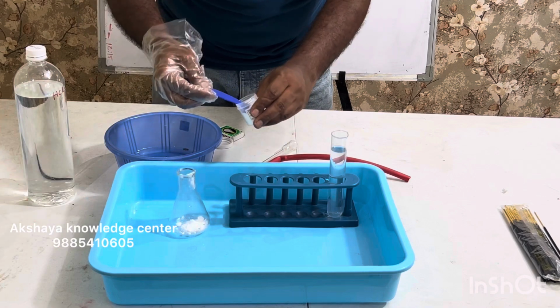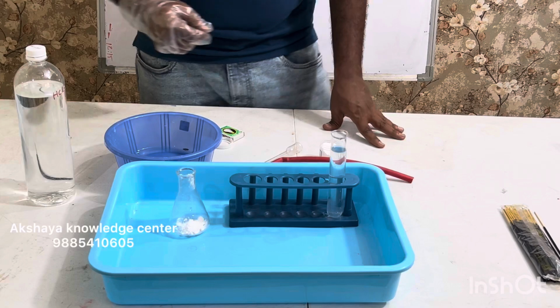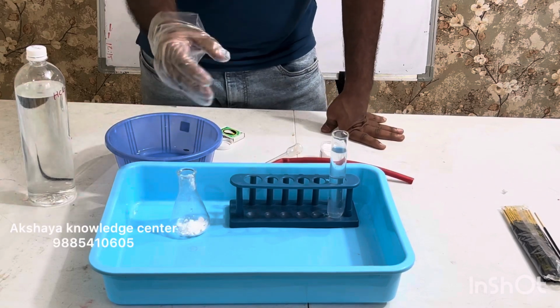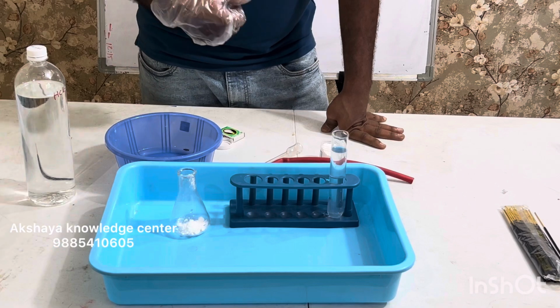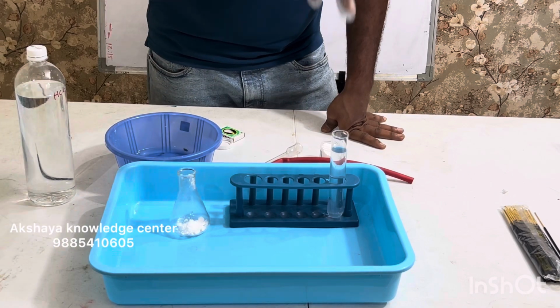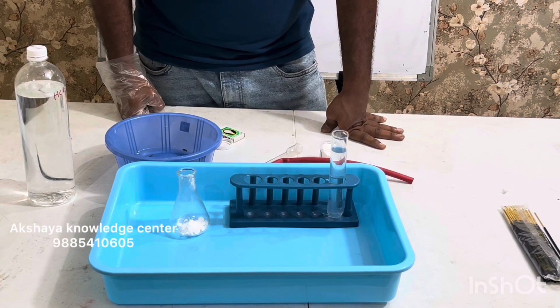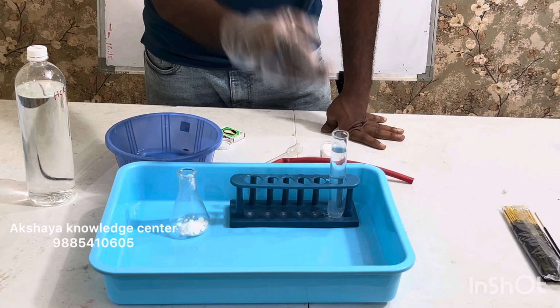Now the idea is to pour our acid in there. But you have already seen the experiment. As soon as I pour the acid, an enormous amount of gas is escaping into the atmosphere. So how can I transfer this gas into our lime water solution? We want to prove in a scientific way that the gas that is released here is carbon dioxide.